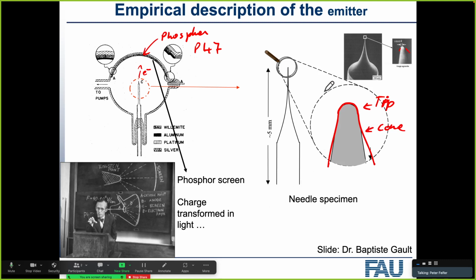And if you look at that, the question is then, what is the electrical field that you get? If you go into your physics books and you say, okay, I have a charged sphere with voltage V, then the field on the surface, or the field at any radius r, is the voltage divided by the radius r.